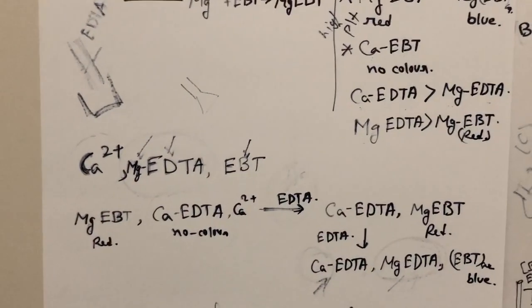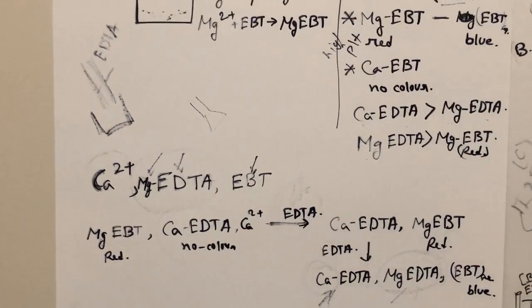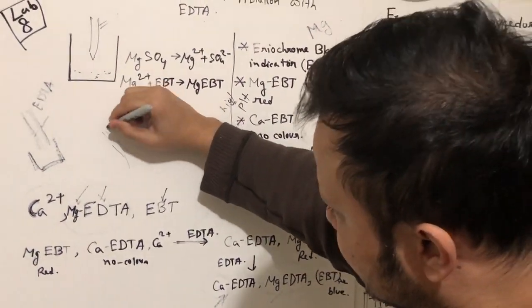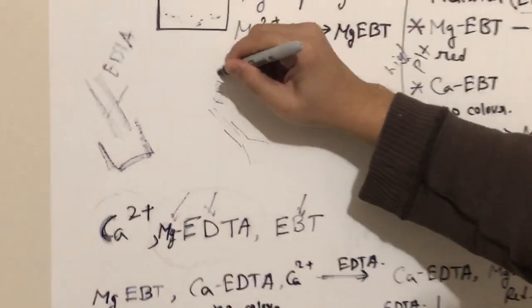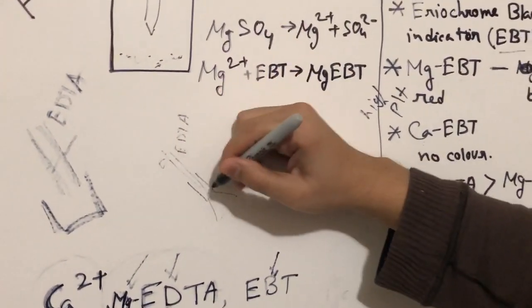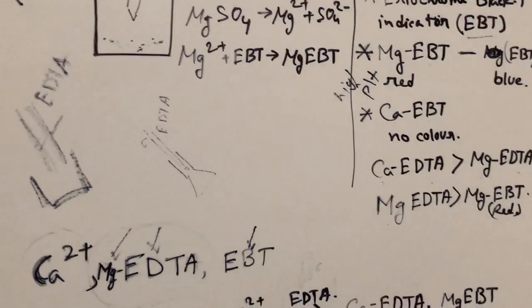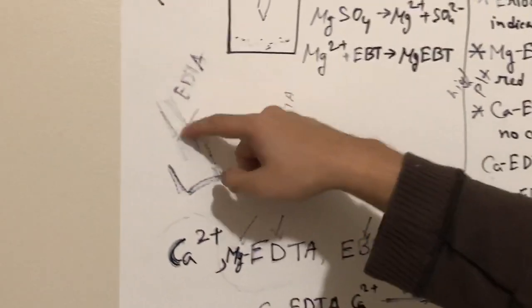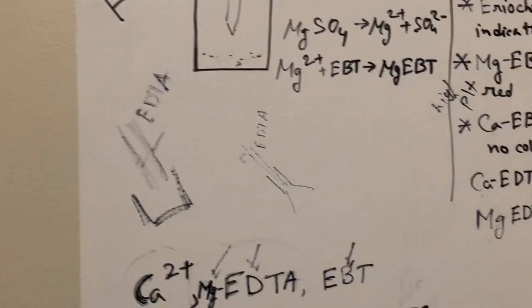Okay. So now if you are adding standard EDTA solution from a burette, then what will happen?